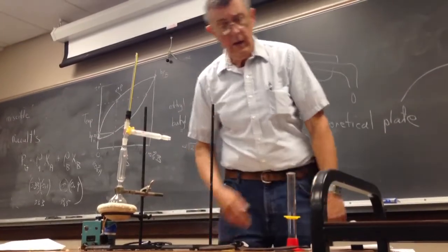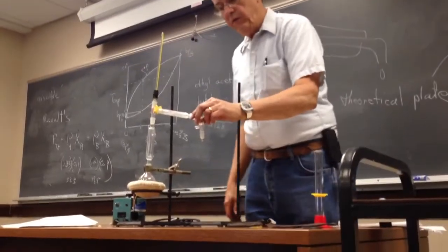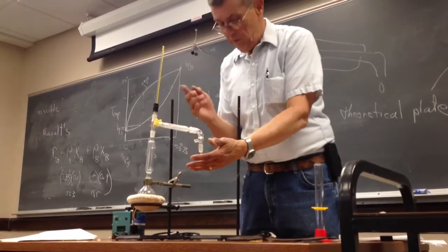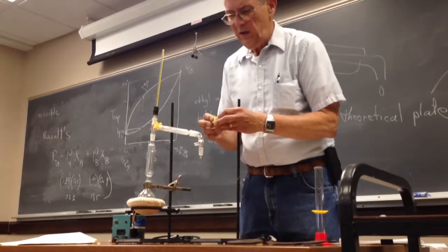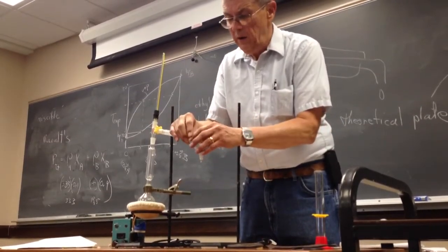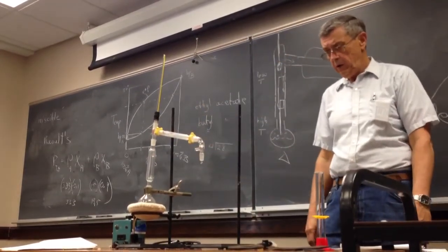It's going to drip out here. I'd actually like to direct it more intentionally. I'll use this, put it on. Likewise, it would fall right off, a little tiny twist, but I don't think I want to take a chance on that because this is going to be heating and cooling, and no, I'm going to clip it. So I've got that, good.